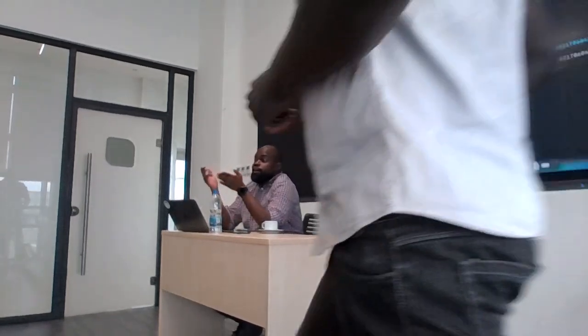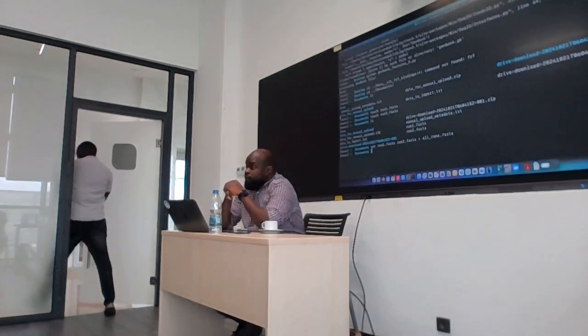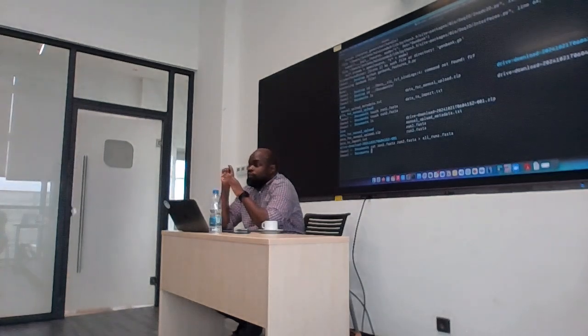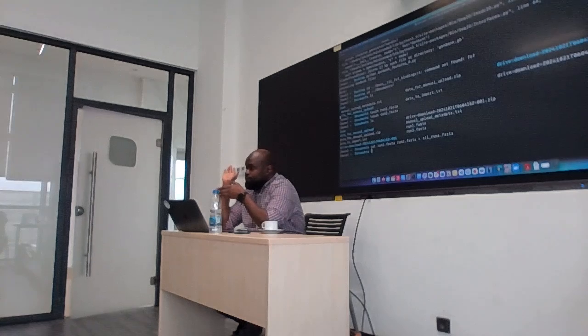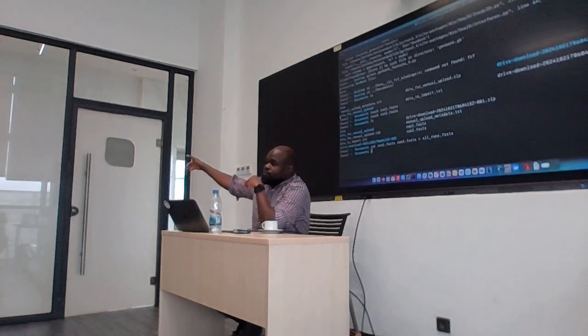Sometimes you're in a directory where all the files you want to join together are called something.fasta, right? So let's say I want to join all the files that have a suffix or an extension called .fasta. What do I do?